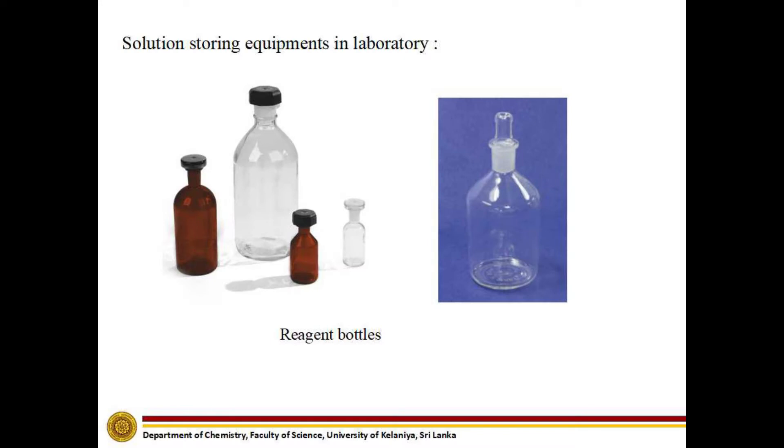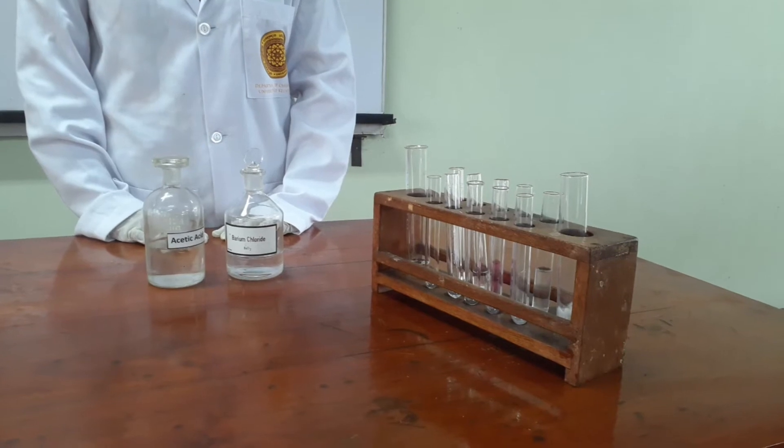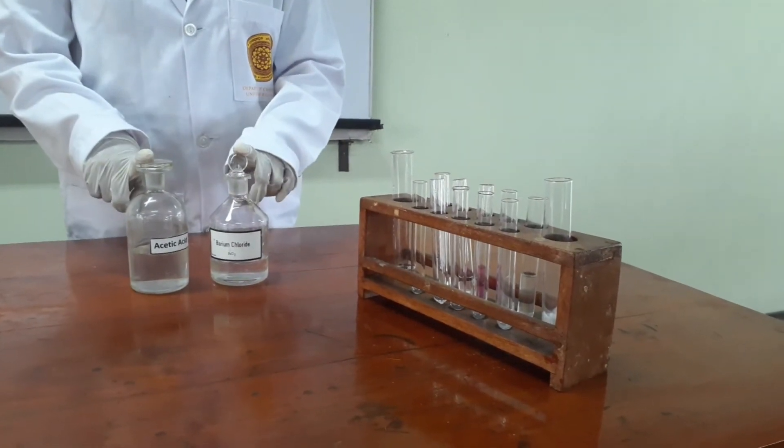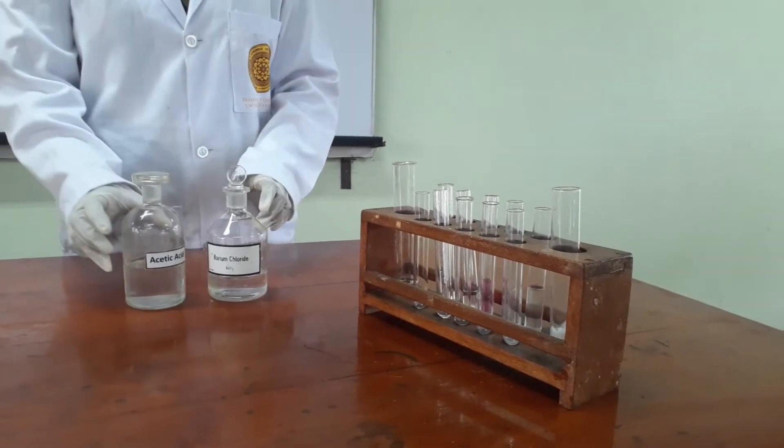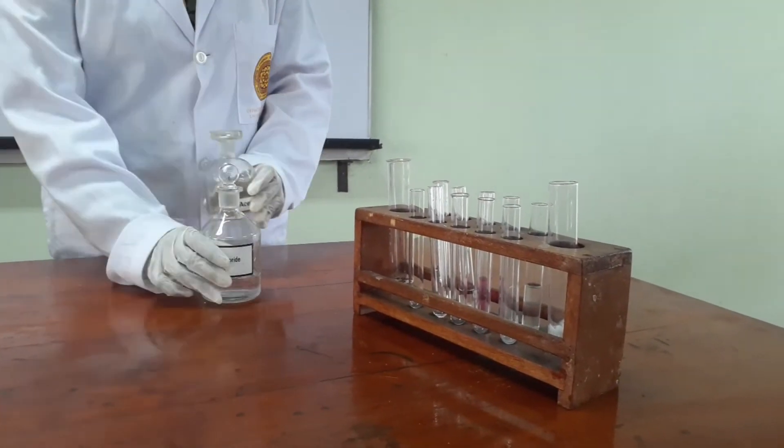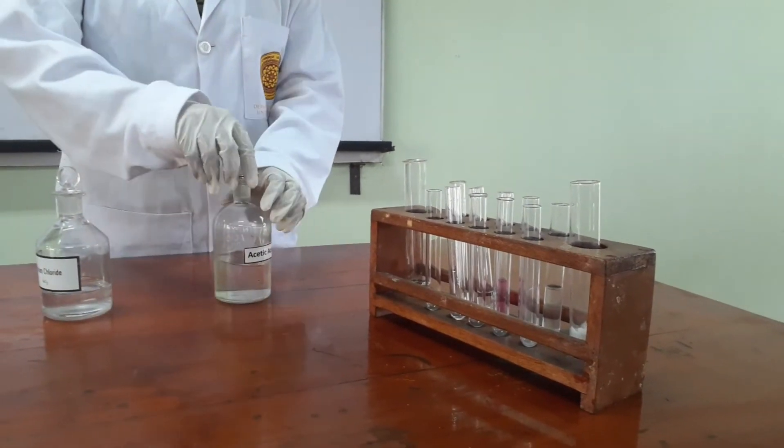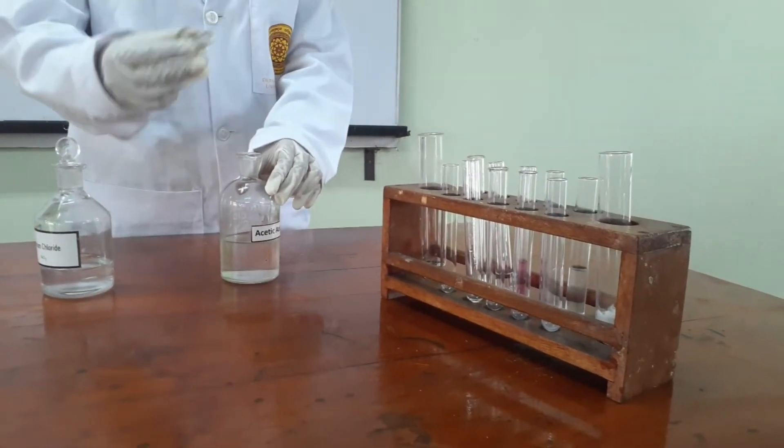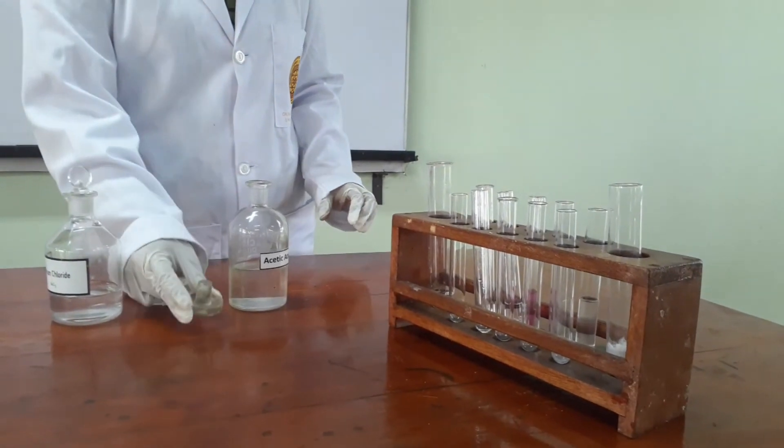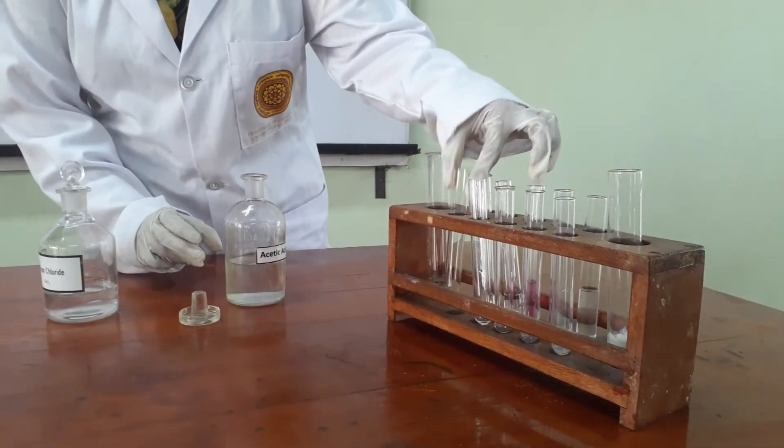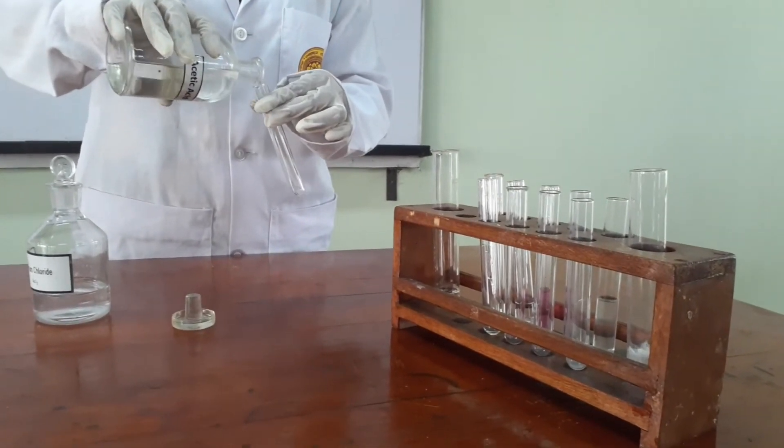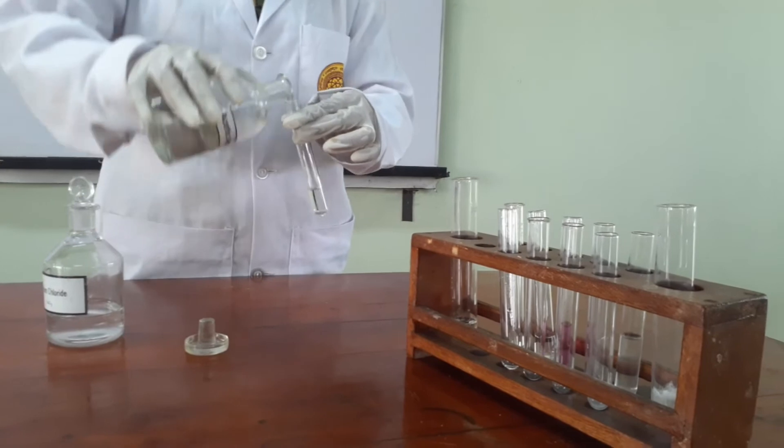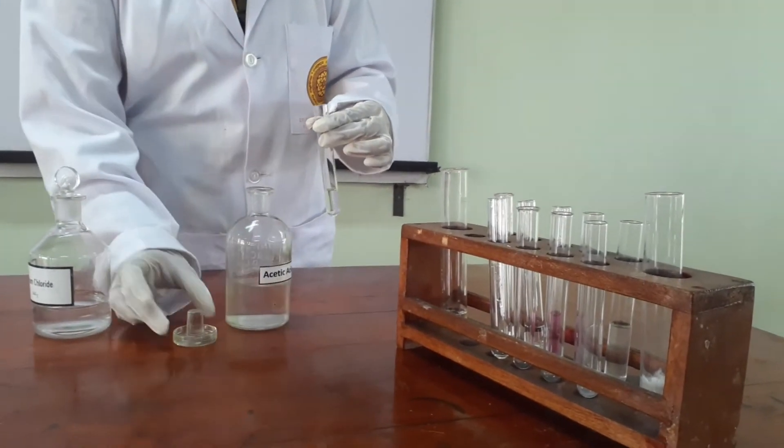Solution storing equipment that we use in our laboratory. We use two types of reagent bottles to store reagents in a laboratory. When we are using this reagent bottle, we remove the cap like this and place it on the table like this in order to avoid contamination. Then we pour the solution into a test tube and take whatever amount that we need by using a dropper.